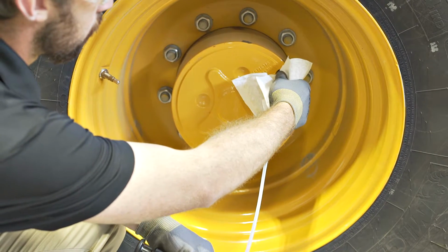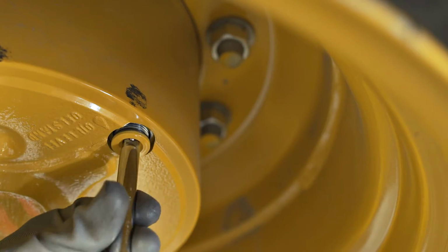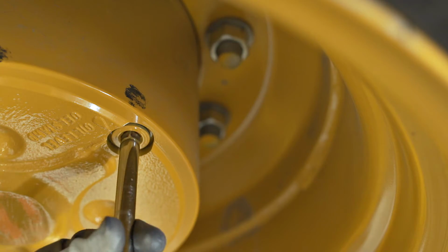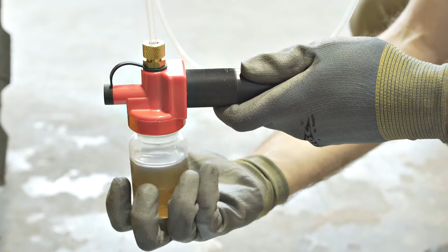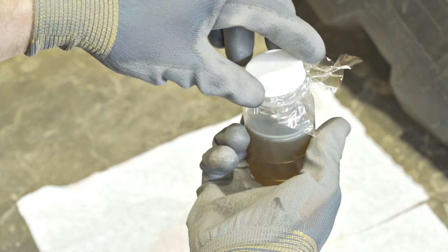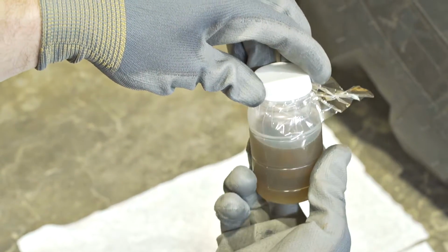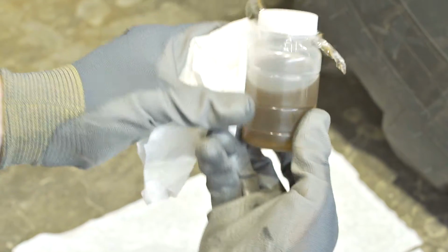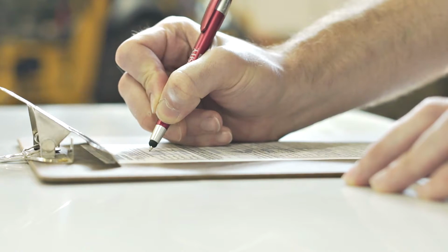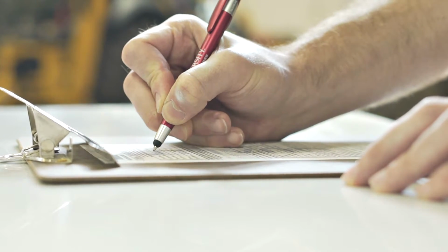When sampling from a reservoir, make sure that the sample is not obtained from the bottom of the oil compartment where contaminants accumulate, and avoid scraping the tubing along the sides of the tank or reservoir. Note: if oil enters the pump, disassemble and clean it before taking the sample. Do not reuse tubing. Remove the bottle from the vacuum pump and secure the cap on the bottle. Fill out the sample information form completely and submit the form and sample to the designated regional lab for testing.